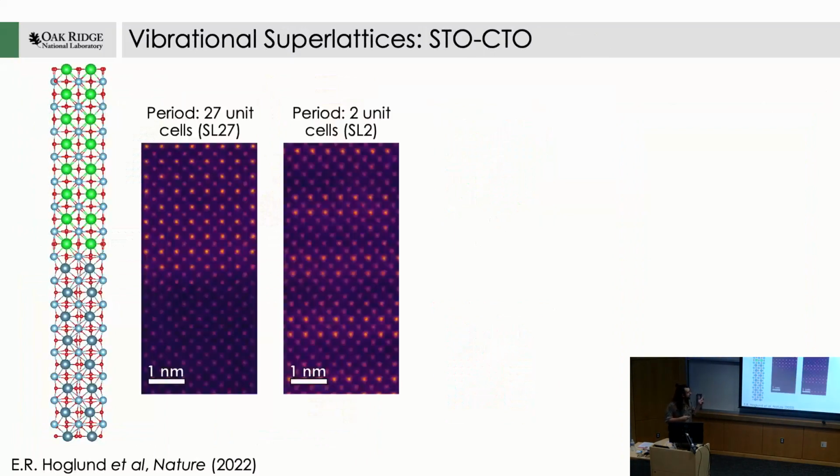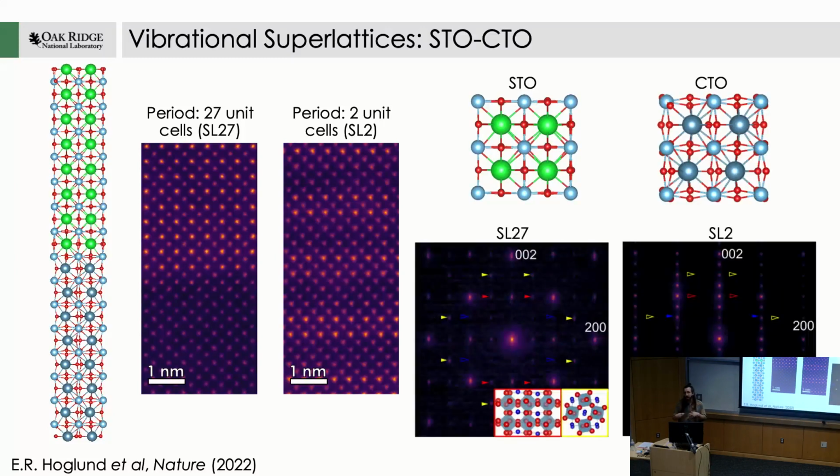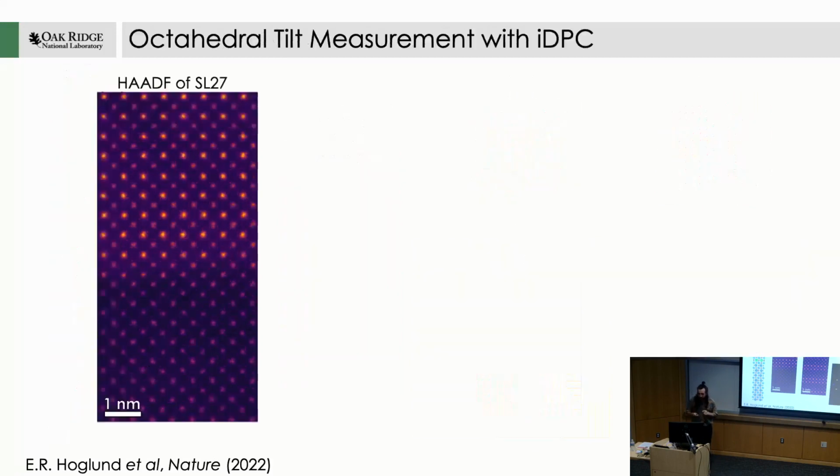So starting off with the STO-CTO, what we were really interested in was the effect of the periodicity in this superlattice. So you can compare a 27 by 27 unit cell superlattice to a 2 by 2 unit cell superlattice. And what Eric found by doing selected area electron diffraction was you can see diffraction peaks that are present in the high period superlattice, the SL27, that are not present in the short period superlattice. So what we know is there's symmetries in the crystal that are present when a large period is in the superlattice that are gone when it's in a short period superlattice.